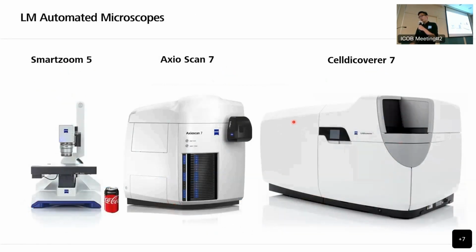And maybe in 10 years, automation of microscopes is the main trend. You may have heard of other companies like Molecular Devices and Agilent that invest their money in making automatic microscopes.